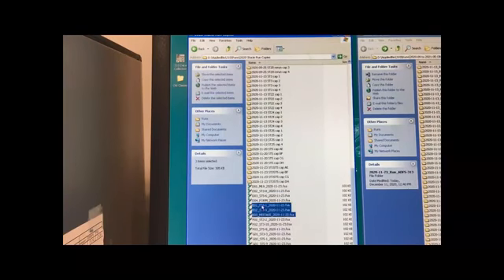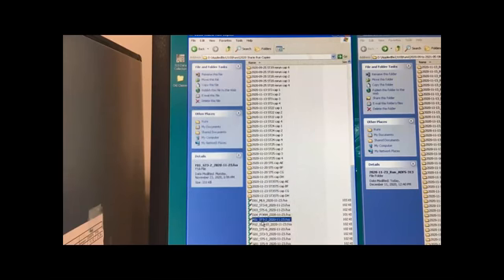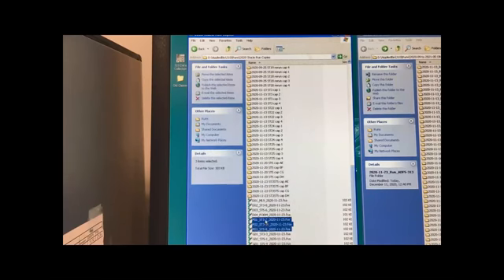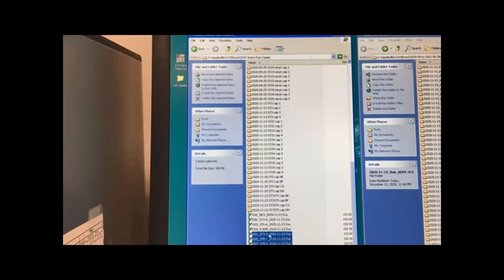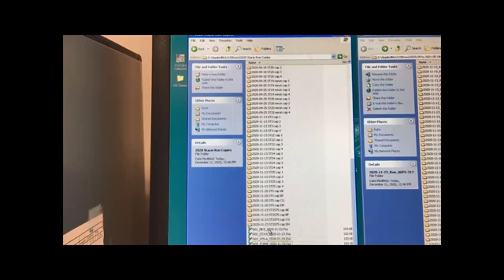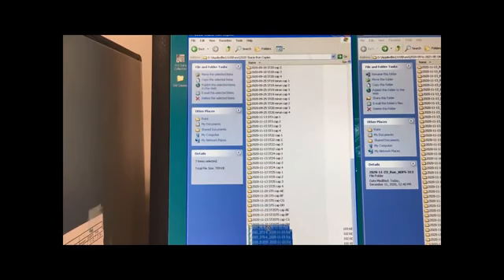If you do this right, where you run your ladder in A, B, C, D, you make 4 ladders, 4 ML9 ladders, the first run, then what you're going to wind up with, and what's important for the way the software works, the single capillary software, is you have one ladder in each of those folders. So it looks like you ran one ladder in each of those capillaries, and that's going to allow you to do your analysis very easily.